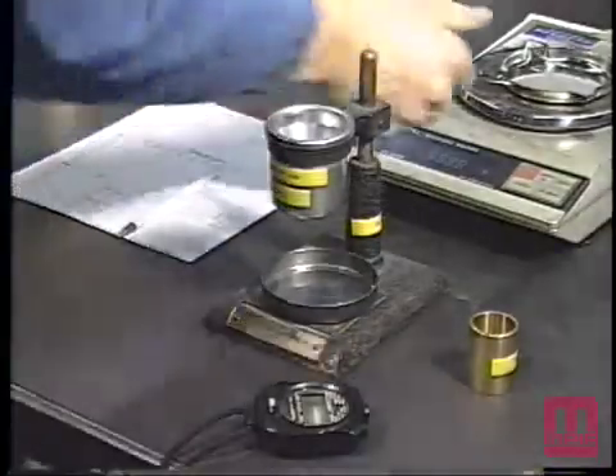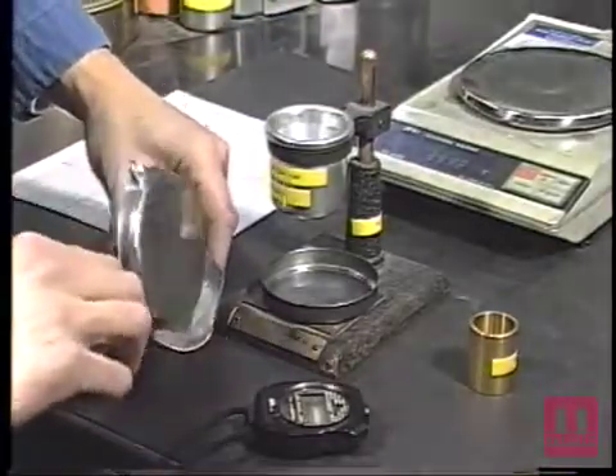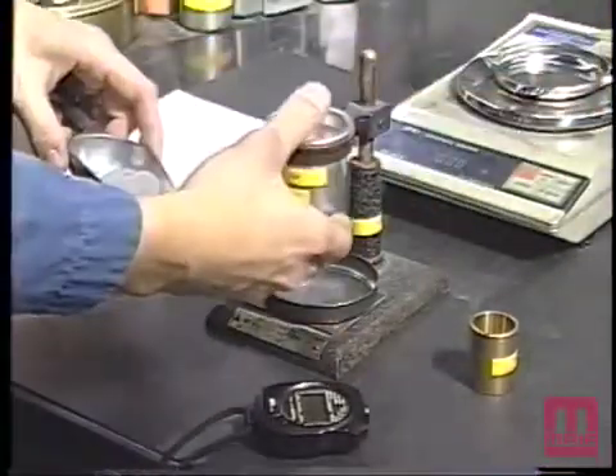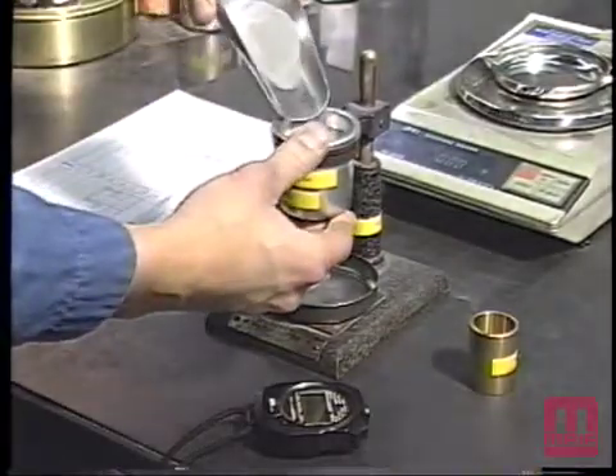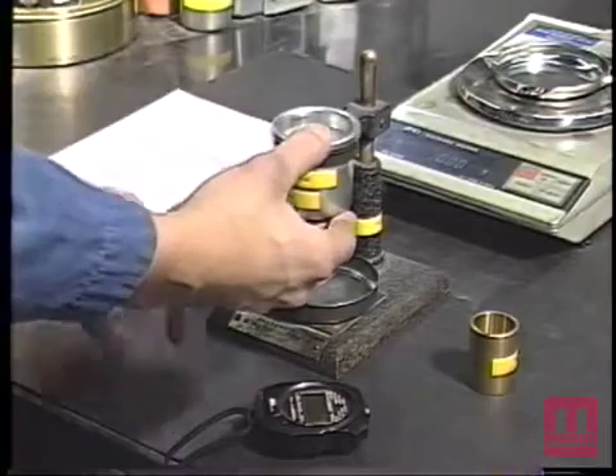The test specimen shall be carefully loaded into the flow meter funnel while keeping the discharge orifice at the bottom of the funnel closed by placing a dry finger under it. Care should be taken to make certain the short stem of the funnel is filled.